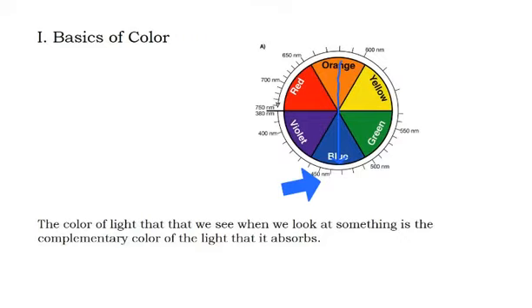Remember that visible light has wavelengths from somewhere around 380 or 400 nanometers to about 750 or 800 nanometers. So this wavelength 450 to 500 nanometers will be in the blue region of the spectrum. On the other hand, the second compound that we synthesized, the pentamine chloro compound, was rose colored, and that's going to be in the red region of the spectrum. And it's more towards the violet edge of the red.